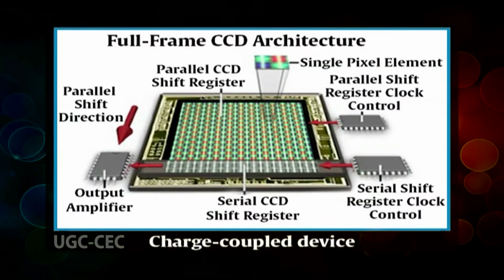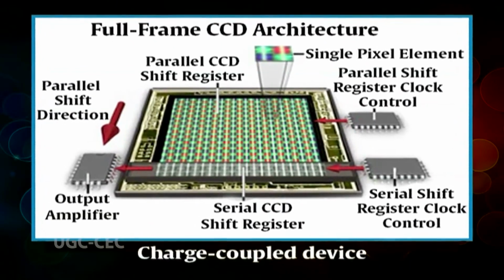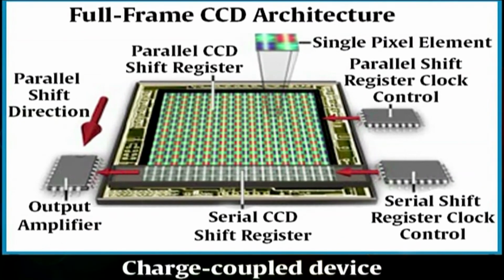The partially transmitted beam is then magnified by a series of magnetic lenses until it is recorded by hitting a fluorescent screen, photographic plate or light sensitive sensor such as a CCD camera. The image detected by the CCD may be displayed in real time on a monitor or computer. Transmission electron microscopes produce two-dimensional black and white images.